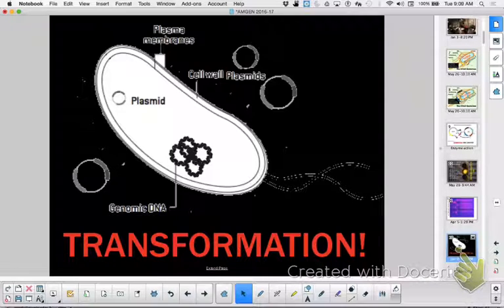Anything would grow on it. And so you'll plate some like that, and then you'll plate some on antibiotics, and it'll decrease the amount of growth you have, so only the ones you've transformed will live. And then you're going to have another plate that has antibiotics and arabinose sugar, and that one will be the only one that glows red.